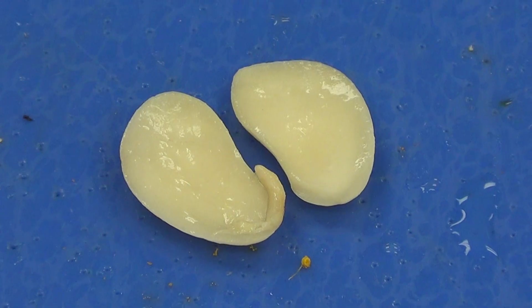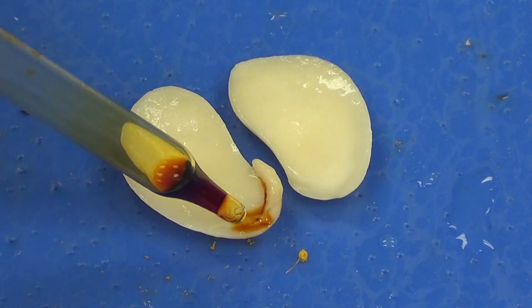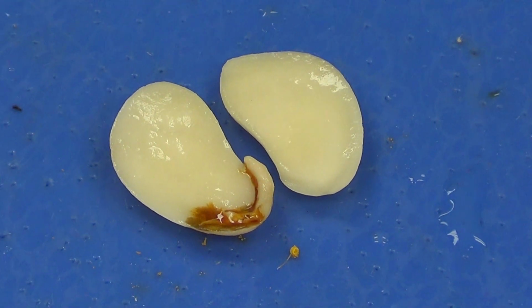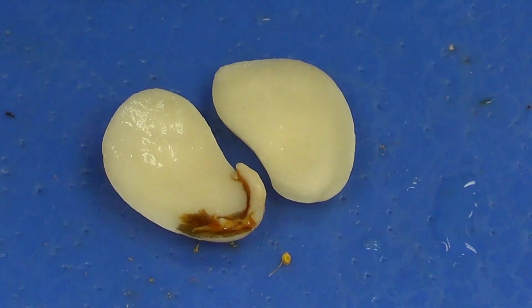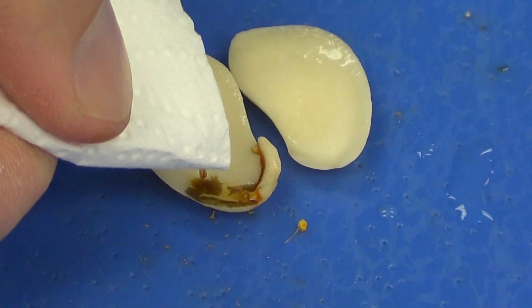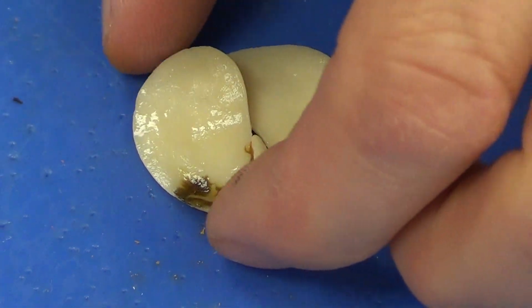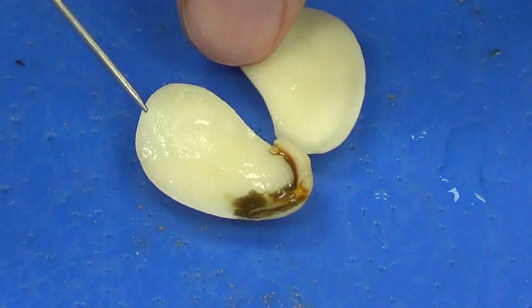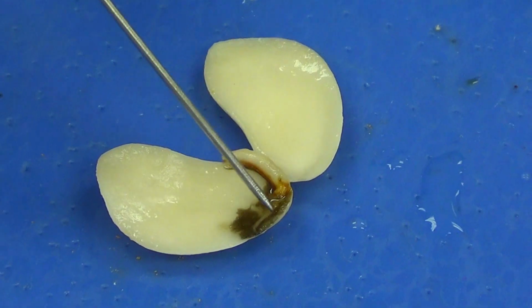So what we can do sometimes, if it's not obvious right away, is put just a very small amount of iodine on here. And then I'm just going to pat this. You can see this white area right here. This is the part of the embryo right here.